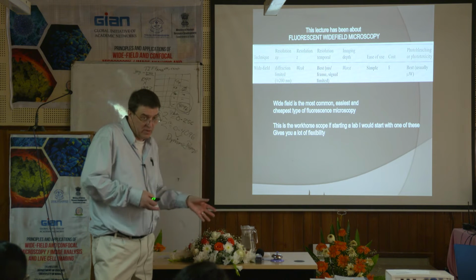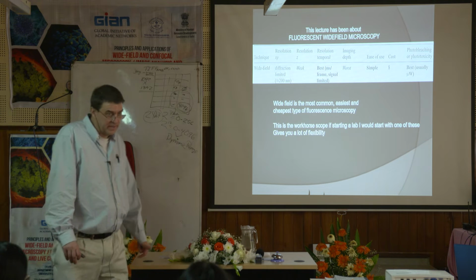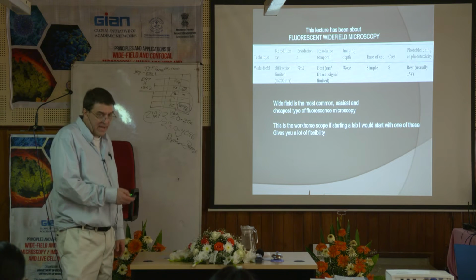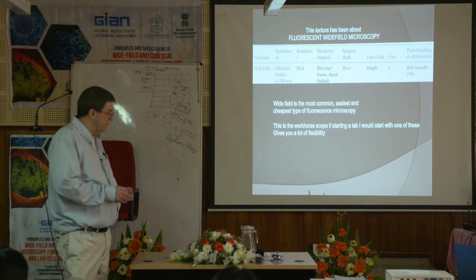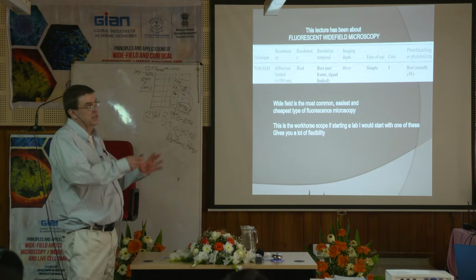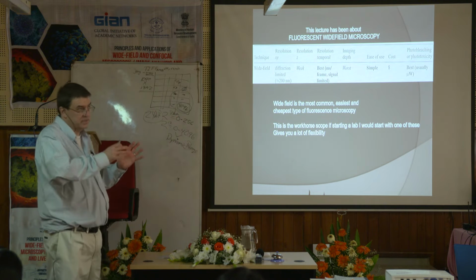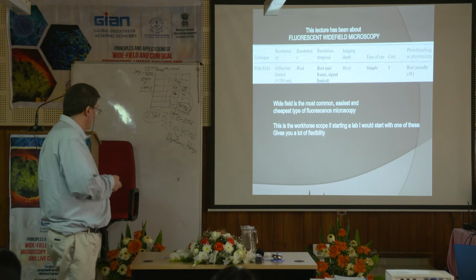We can figure out did it work, didn't it work, and if you really need the confocal, then we'll go to the confocal. Okay, so again, for a lab just starting, or for a good workhorse instrument in a department, this is a great thing to start with, I think. Sometimes the confocal's just too much. It's overkill. And we'll talk about why that is when we get to it.